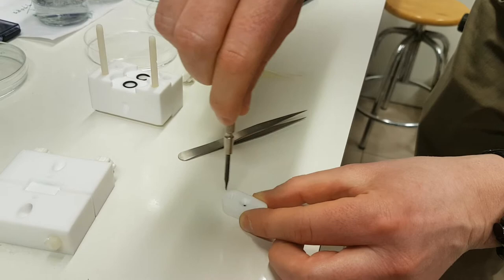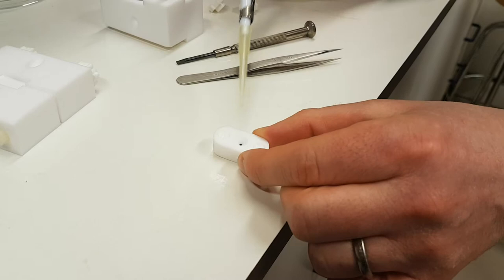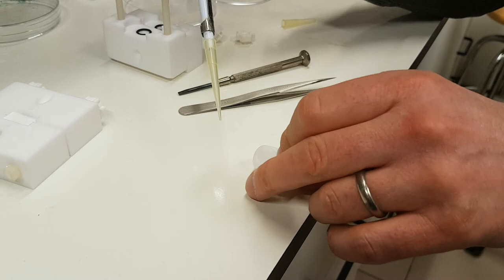Now, I'm not going to necessarily do this now, but I do want to talk about wetting. The joy of this device is the material selection, which happens to be Teflon, and the shape of these wells means that you can, first of all, put in a bit of ethanol. That helps the initial wetting. Then maybe put in a bit of buffer. And as long as you just leave small volumes, it will actually stay within there, and you can do the similar thing on the backside as well. So that really helps you wet the device up.